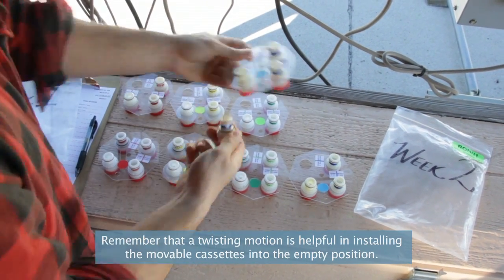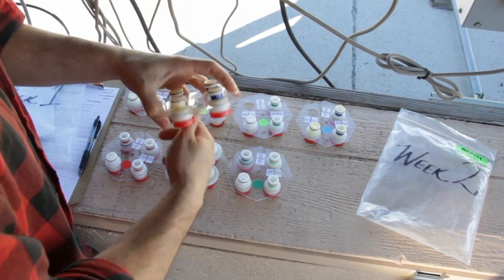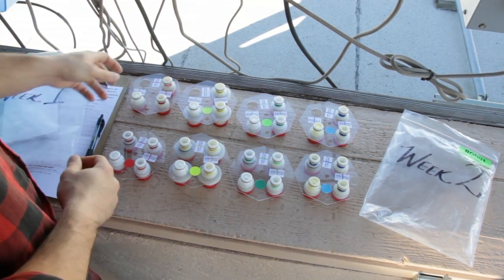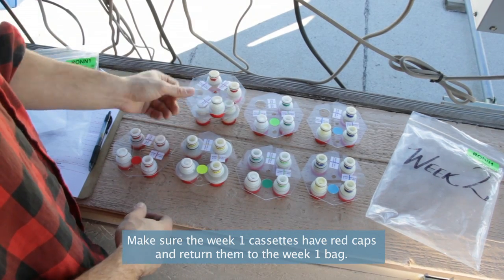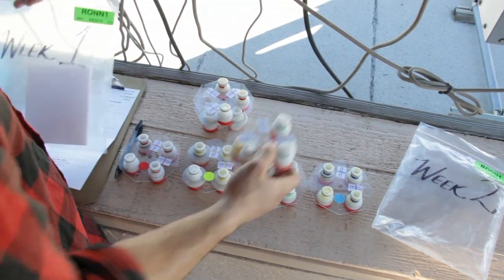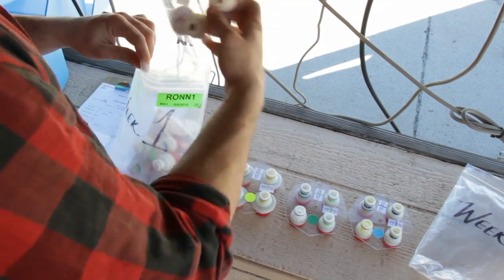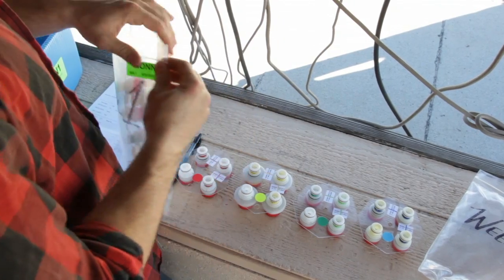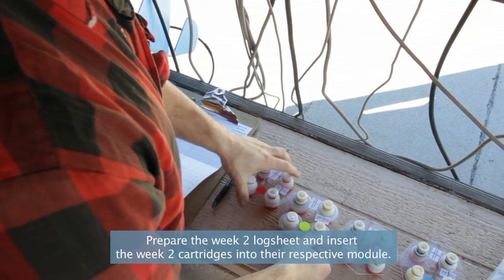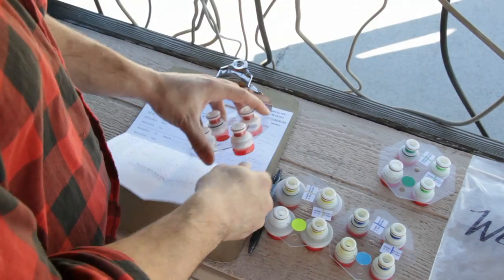Remember that a twisting motion is helpful in installing the movable cassettes into the empty position. Make sure the week 1 cassettes have red caps and return them to the week 1 bag. Prepare the week 2 log sheet and insert the week 2 cartridges into their respective module.